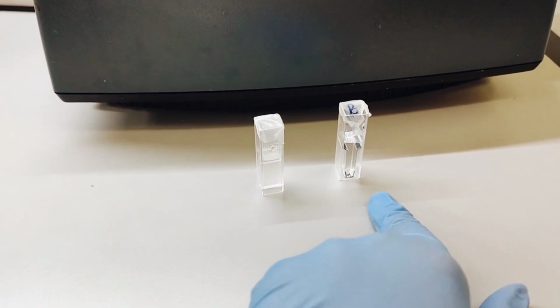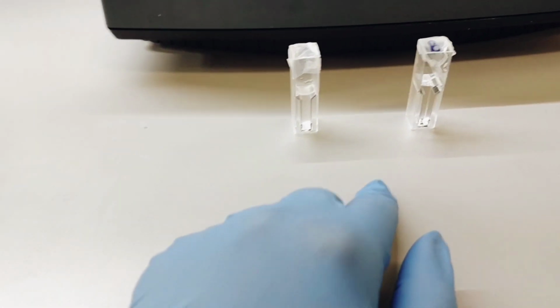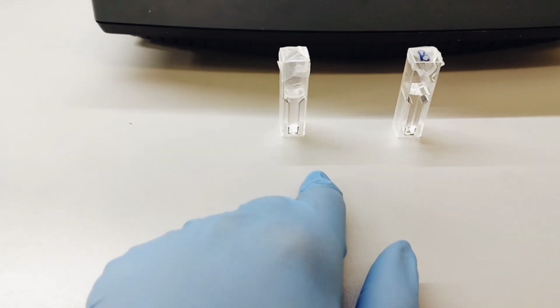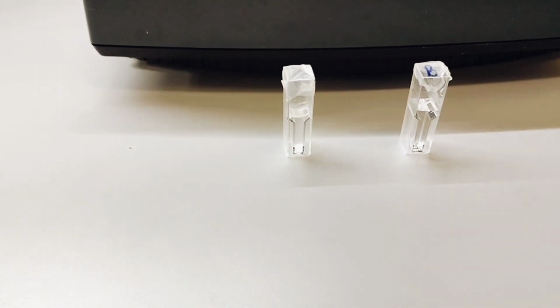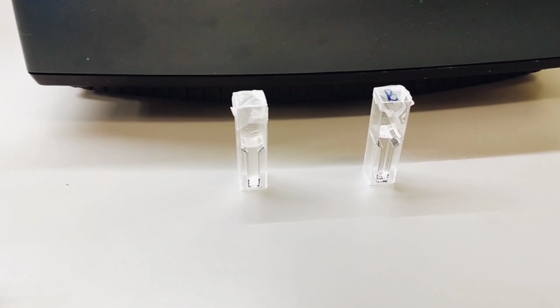So this is a blank with the water, and this is my sample, and these are disposable cuvettes. So I'll throw them out once I'm done, but usually in a research lab, you'll have a quartz cuvette, and those are expensive and those are reusable.